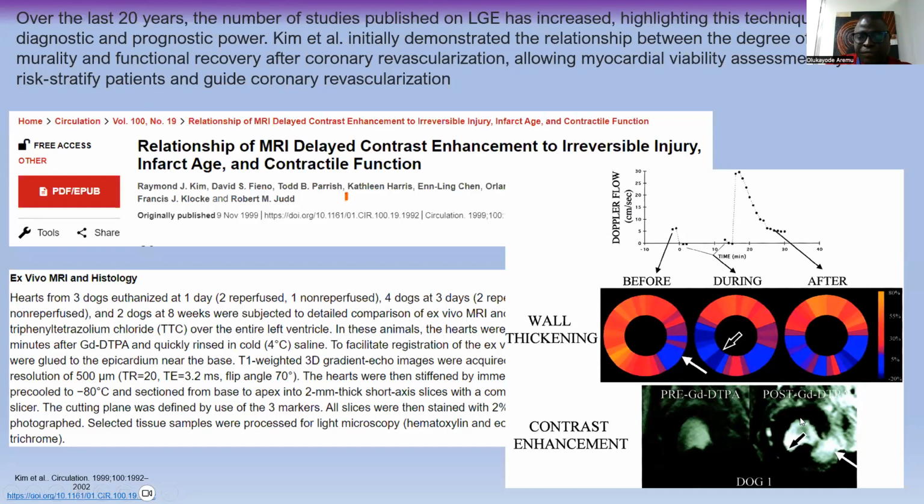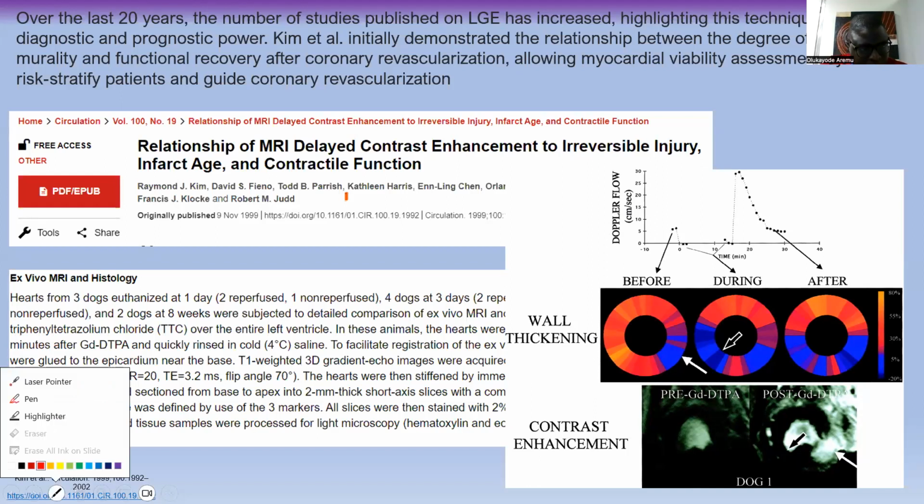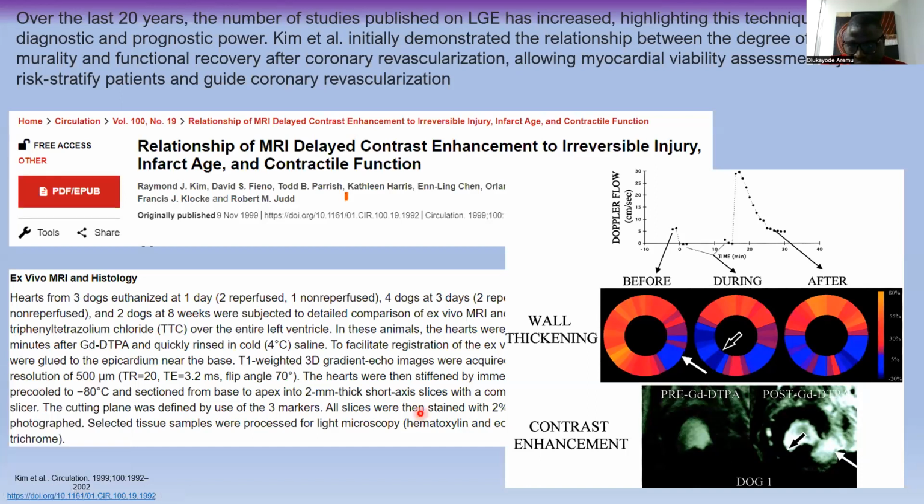to check the infarct that is going on in the heart of the dogs that they check. This is just dog one. But what you will appreciate most here is the infarcted area of the myocardium here. I don't know if my laser is still showing. Let me pick it again. Okay, it's the infarcted area of the myocardium. Awesome.